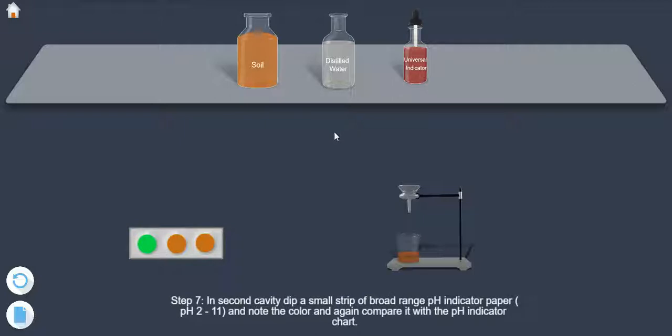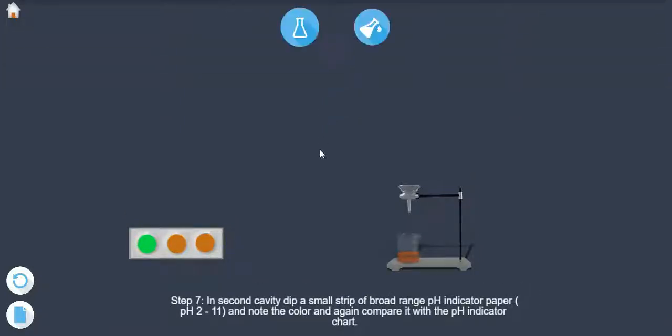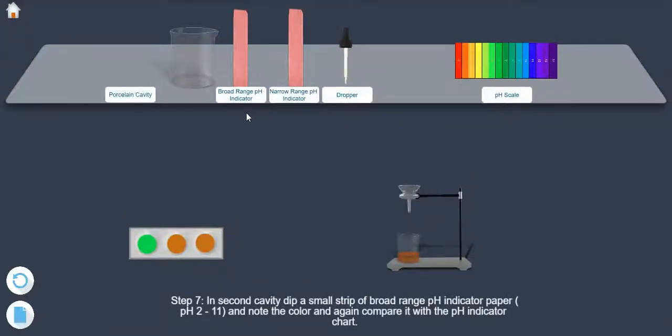Step 7: In the second cavity, dip a small strip of broad range pH indicator paper (pH 2 to 11), and note the color and again compare it with a pH indicator chart.